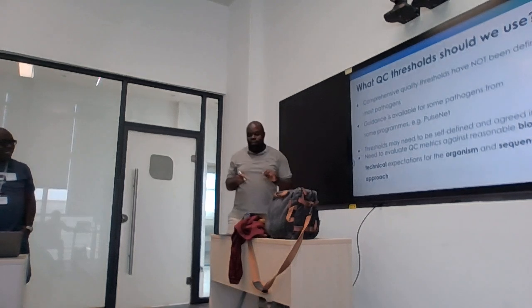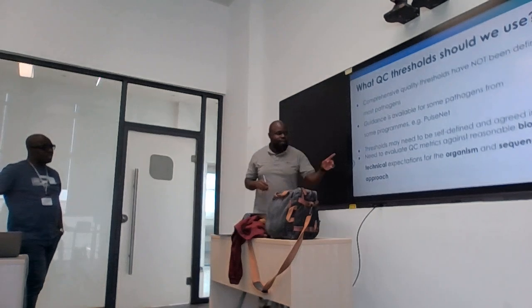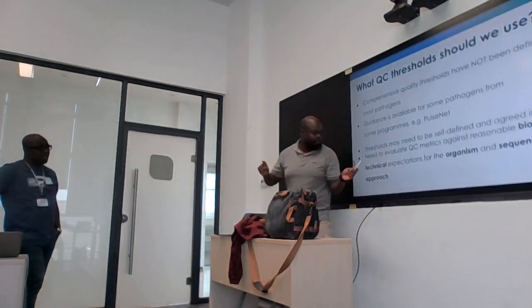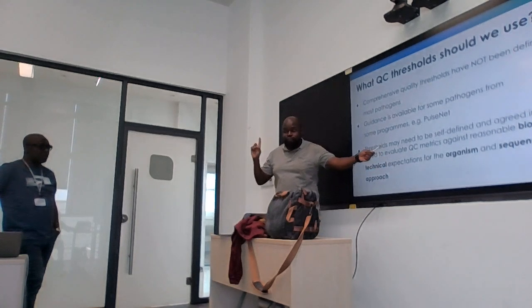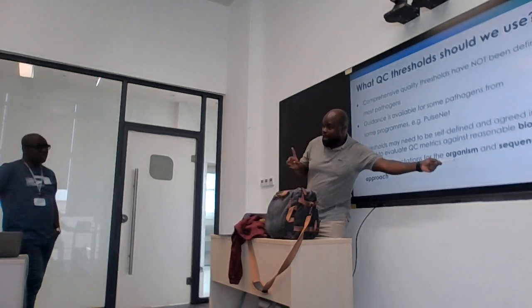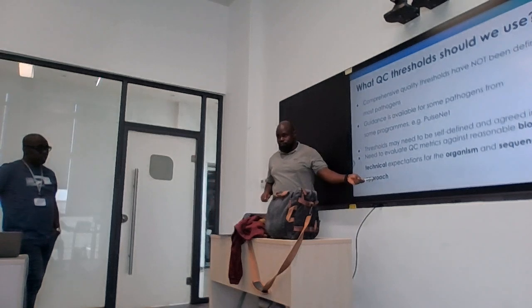But these quality thresholds have to be defined against reasonable biological and technical expectations. Secondly, they have to be specific to the organism and the sequencing approach or technology.